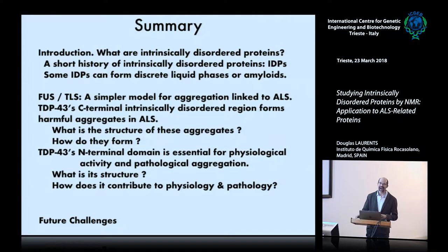Well, I thought I'd start today by giving an introduction, reminding you what these intrinsically disordered proteins are. I'll give a little history of intrinsically disordered proteins and mention what they are. Maybe 20 or 30 years ago, no one knew what they were. And I'll mention how some of these intrinsically disordered proteins can form liquid phases or amyloids.